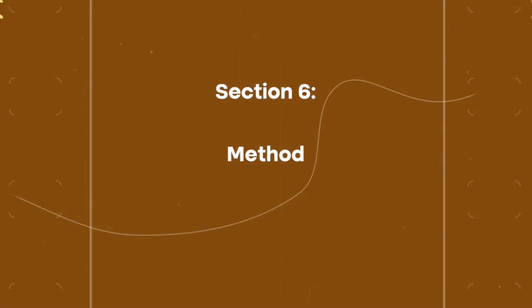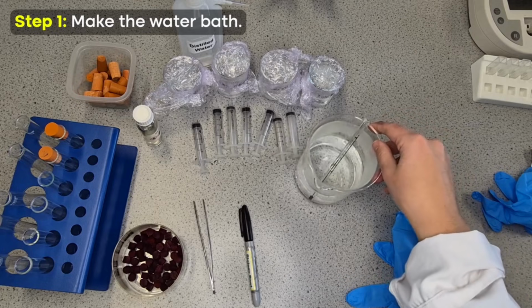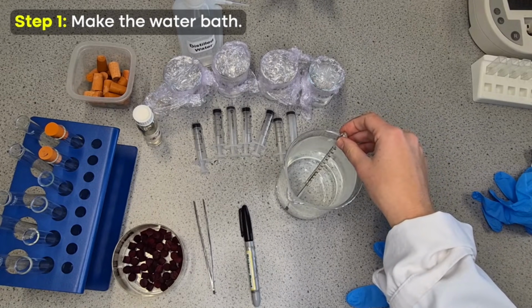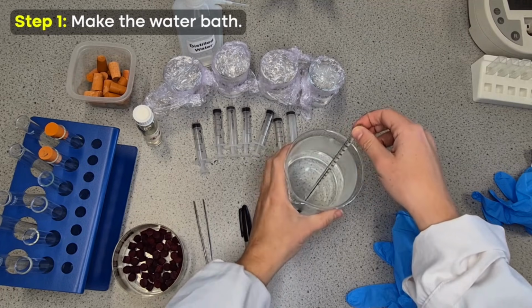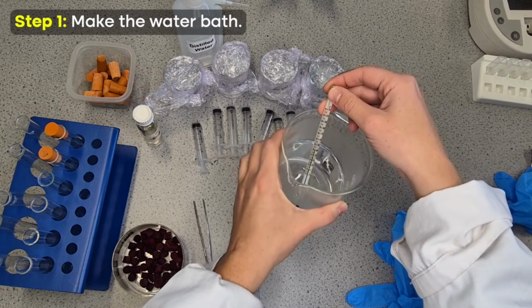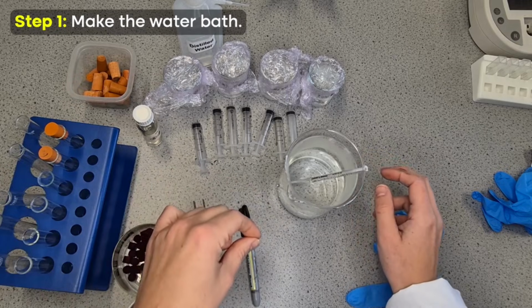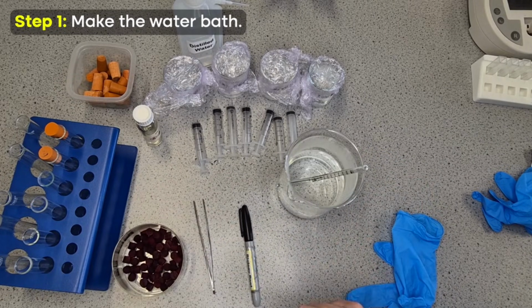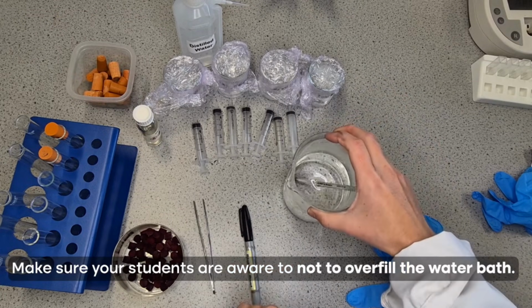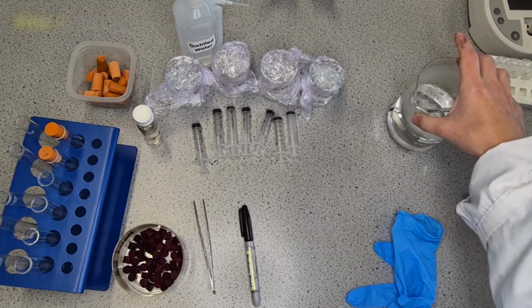So let's go through the method then, starting with I'm going to make the water bath. So I'm actually just using hot water from the tap because most taps, the water is about 40 to 45 degrees C when it comes out of the hot tap. And I'm going for a 37 degrees water bath, which actually that is spot on 37 at the moment. The temperature is going to drop though, so I do have a kettle so I can add hot water throughout to make sure it stays at 37 degrees C. And make sure your students are aware not to overfill the water bath, because as soon as you put your test tubes in, the water rises and it could overflow. So that's my water bath made.